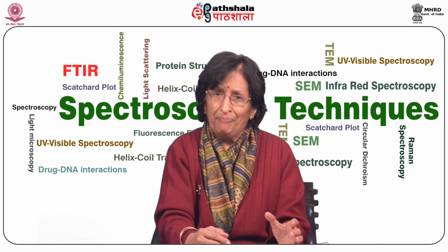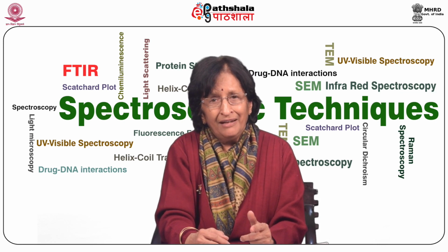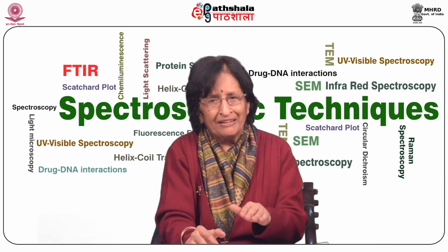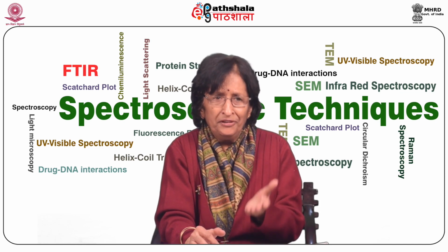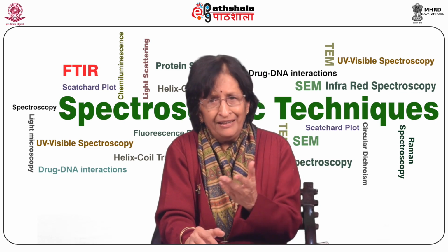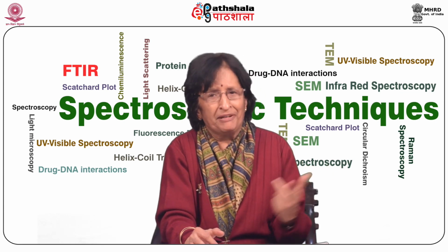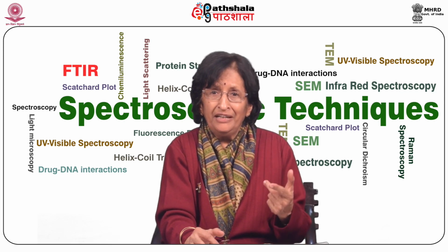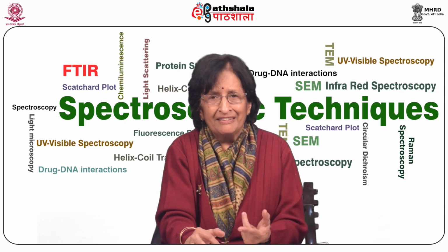Let us see now some special applications of UV-Vis spectroscopy. One can measure absorbance at a fixed wavelength. We don't have to change the wavelength, but at different temperature. This is typically done in DNA melting measurements. Like we go on heating the sample and just measure the absorbance very quickly. One can carry out a reaction within a cell and measure the kinetics or rate constant of a chemical reaction. One can measure equilibrium constant of a reaction by performing measurements at definite intervals.